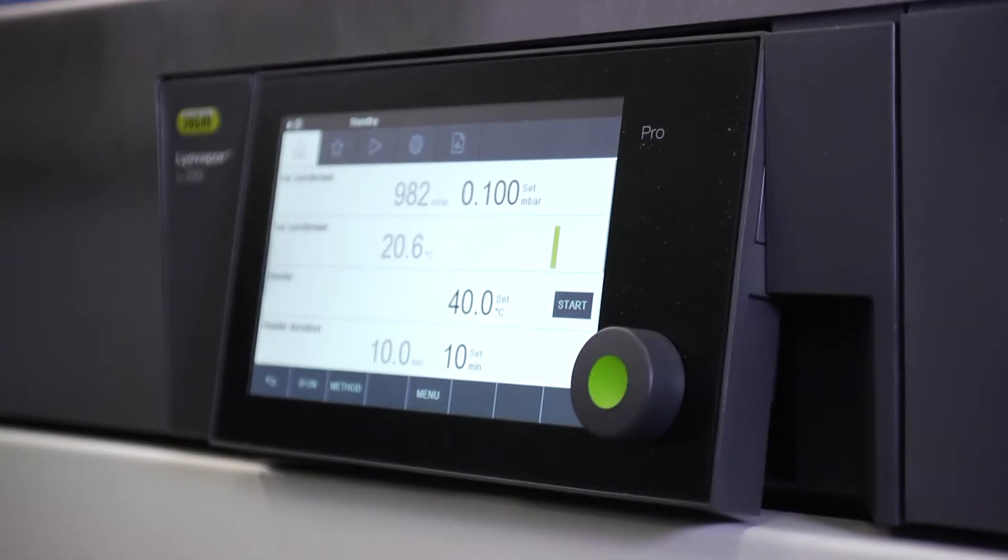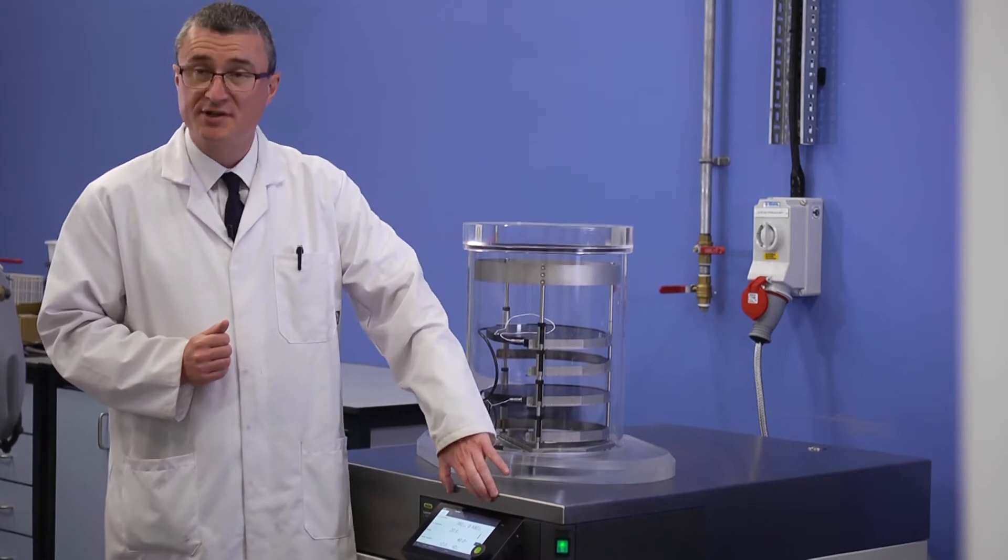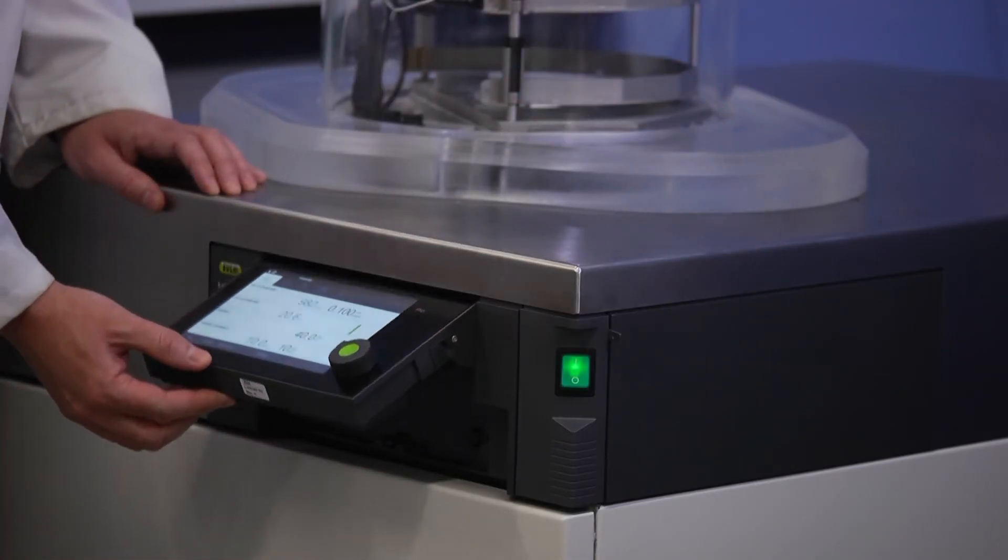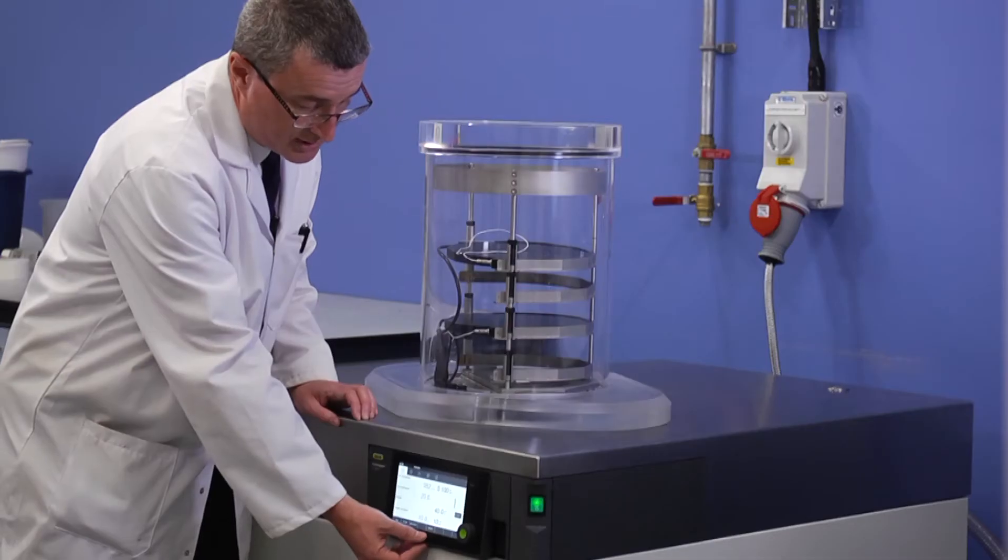The control panel can also be positioned at the front of the equipment or at the side and it can be adjusted according to requirements.